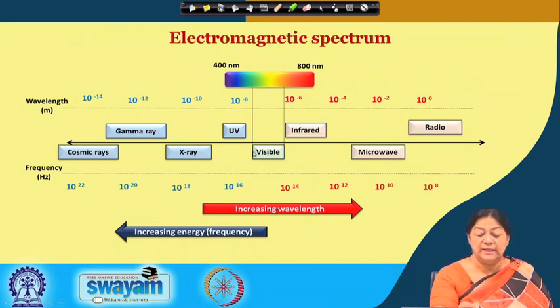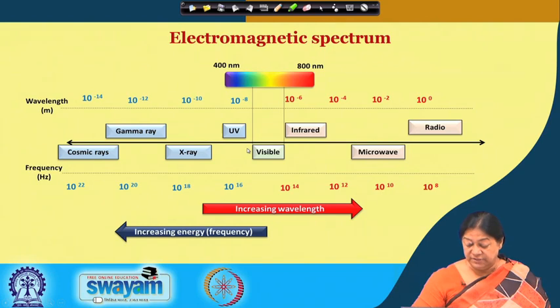We all know that the visible light that we see spans 400 nanometer to around 800 nanometer, and this is the UV-Vis spectrum, the rainbow colors that we know. The ultraviolet forms just before the visible, and the infrared region is away from the visible range. Now, we will be concerned with UV visible spectra, and we will see why we need to consider only UV and visible cases.